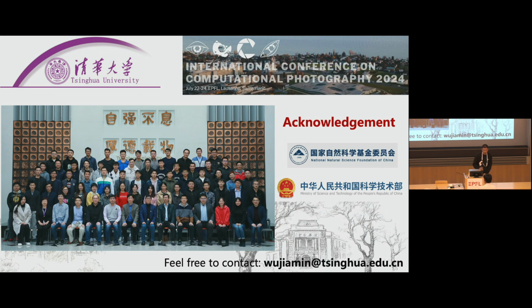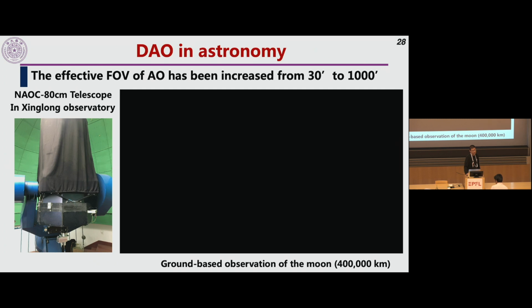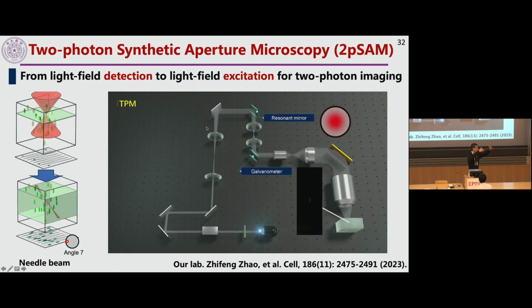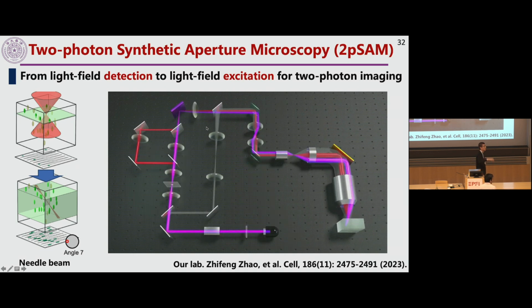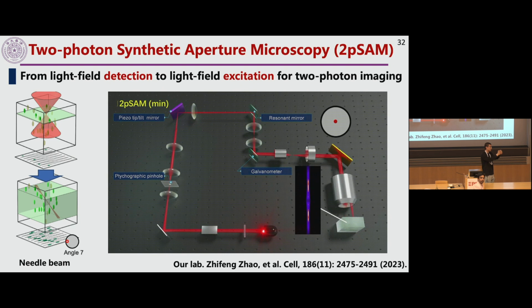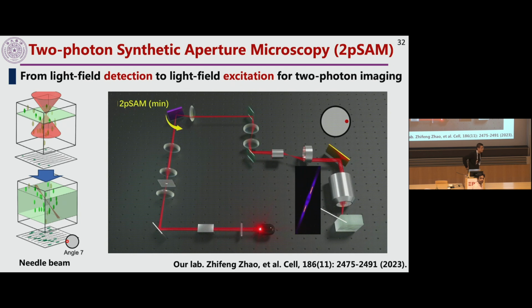Not the same sensor, it's a different sensor, but it's an area sensor. We change the excitation path, so it's a two-photon excitation. It's not detection; it's still total detection with a single PMT. Oh, PMT. Yeah. It's wavefront shaping, a modulation of the light rays into different angles. Okay, thanks.